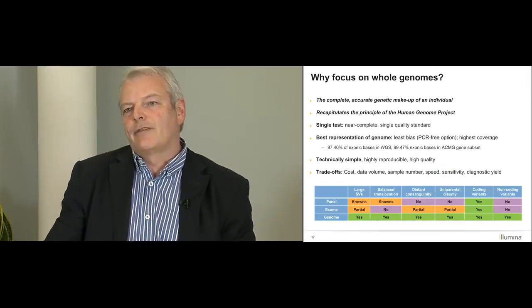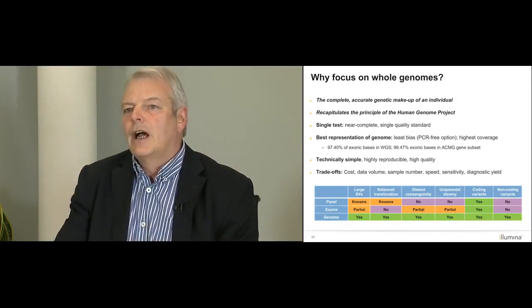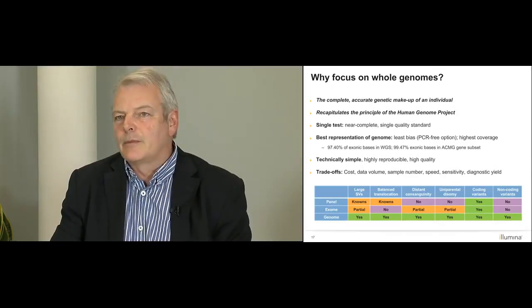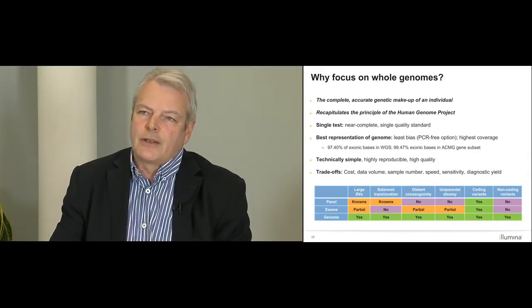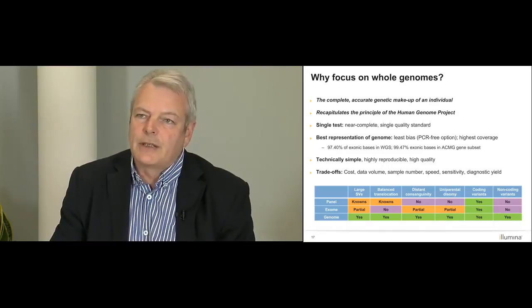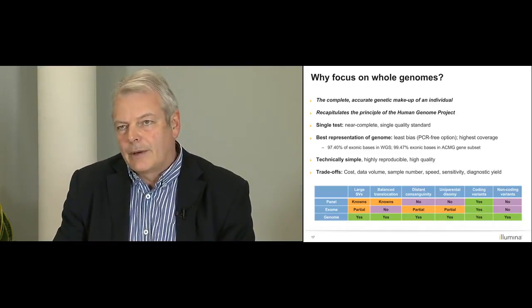I wanted to return for a moment to the question of whole genomes. I've emphasized the use of whole genomes. That is not to the exclusion of other methods. I've already shown you a targeted sequencing process. But this just summarizes a few points which are worthy of discussion as to why one would focus on whole genomes, or why we focus on whole genomes, and why this also resonated with Genomics England and a number of other collaborators and projects that we are now involved in.